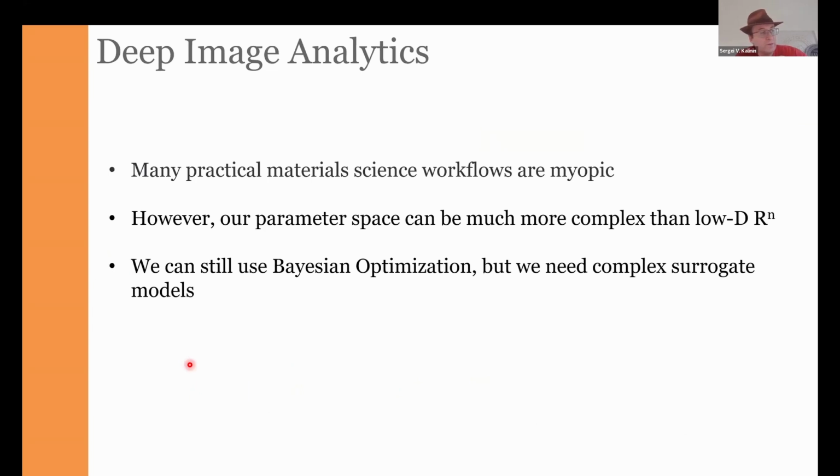Now, we don't have much time, so I'm going to only very briefly mention it. So notice that one of the very important things in building the automated experiment is the amount of data that we extract out of the measurement. So for example, for the topography measurements, we have to find our reward function as the roughness or the correlation length. For ferroelectric measurements, it can be a loop area. For X-ray measurements, and so on and so forth.